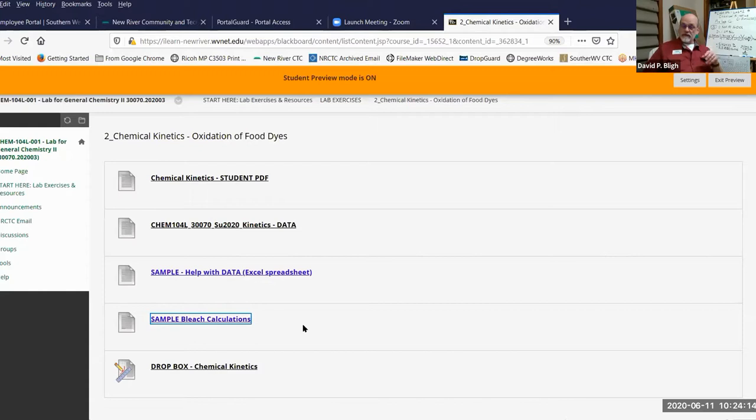But the other, since the blue dye is food grade, right? You don't have to worry about that. You could drink it, but you can't drink bleach, and you don't want to get bleach on you anywhere, in your eyes, on your skin, or even on your clothes. You'd rather it hit the lab coat and let it absorb the bleach. So those are the two main issues: broken glass and bleach.